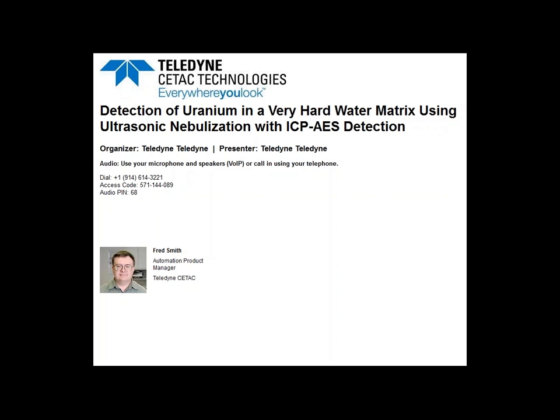Thank you very much for the introduction, Bob. Today I'd like to talk to you about a very particular application that came up for us, and that is the detection of uranium in a very hard water matrix, but using ICP-AES detection.